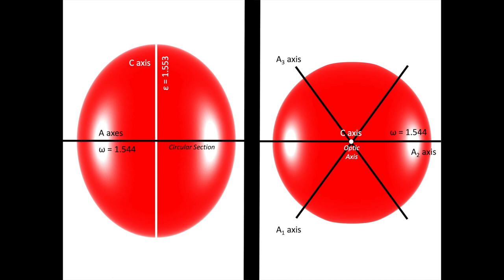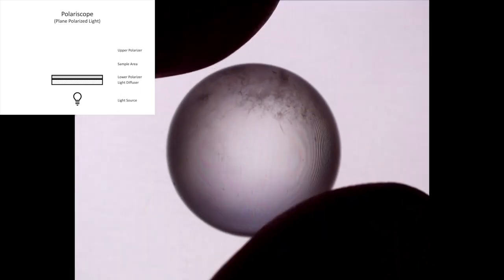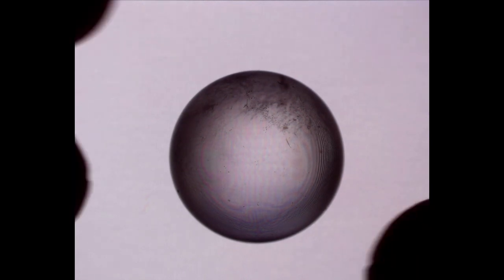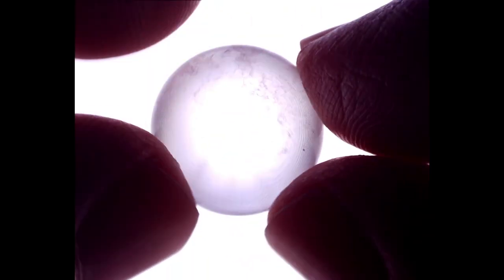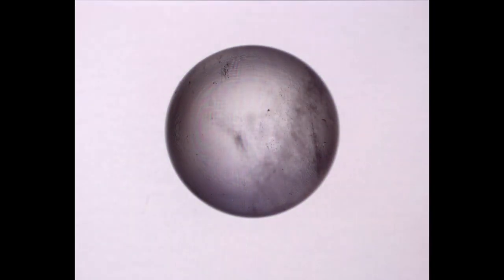Now that we've gone through the theory, let's take a look at our quartz sphere using our polariscope. We're starting off with a view in plane polarized light vibrating in a north-south direction. You can see some of the inclusions we talked about — these will actually help you follow the rotations as we move the quartz sphere in space. We'd have the possibility of seeing pleochroism, so let's rotate the quartz sphere a bit. We don't actually end up seeing anything, however, because the quartz sphere is clear and so there's no possibility of differential absorption of light.